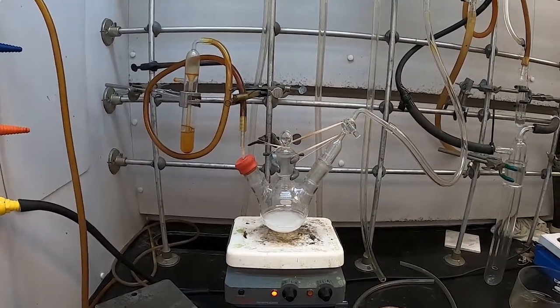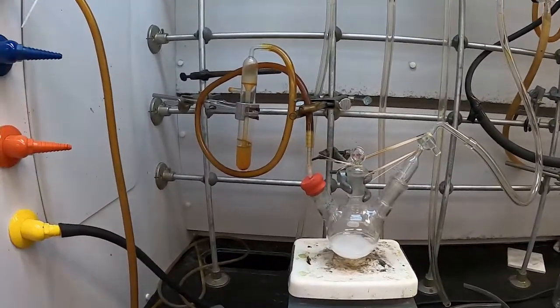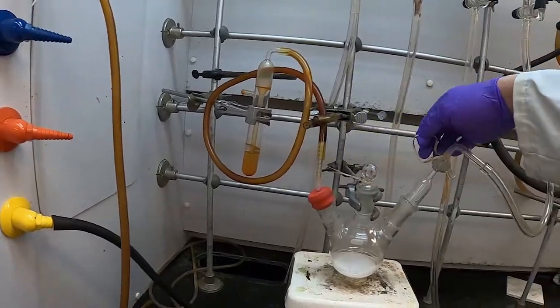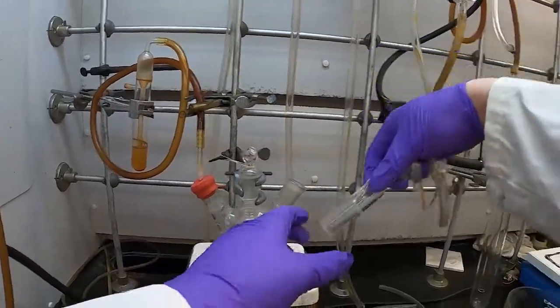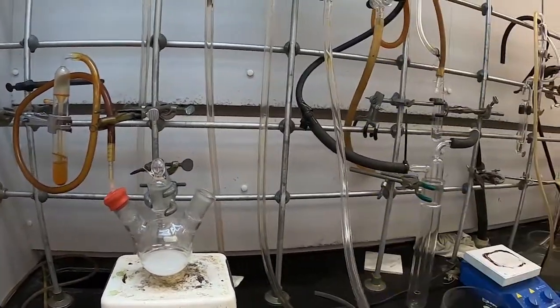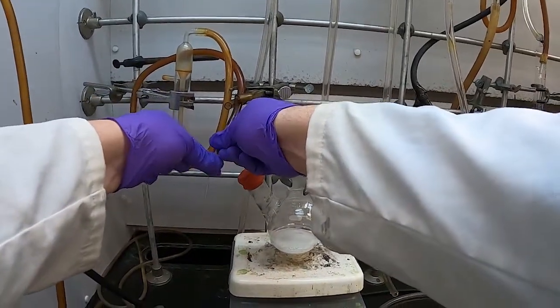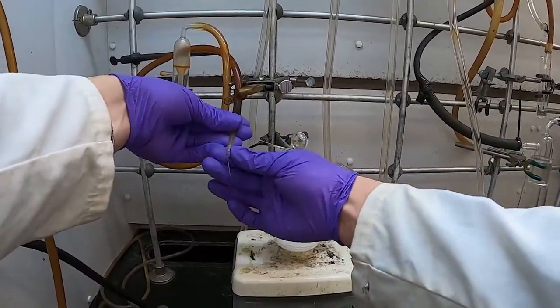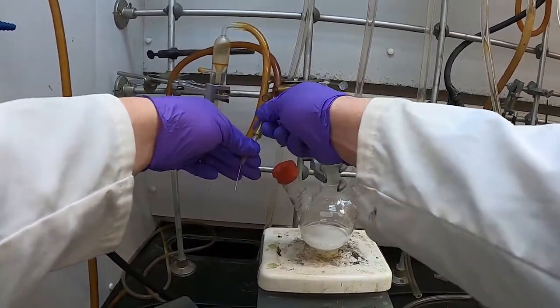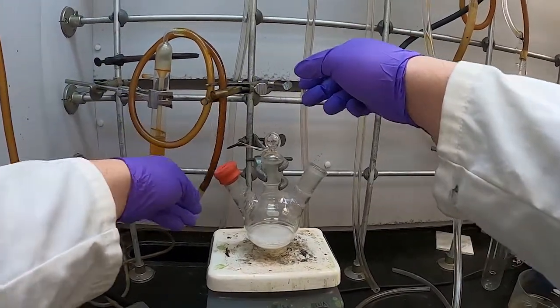So our stirring time is complete now, so we're ready to move on to the next step. So we're going to filter this. So we'll turn the stirring off and remove our gas inlet. Make sure the nitrogen is turned off. We can also remove our bubbler. Be careful with the needle here. Tuck that out of the way. Now we'll remove it later.